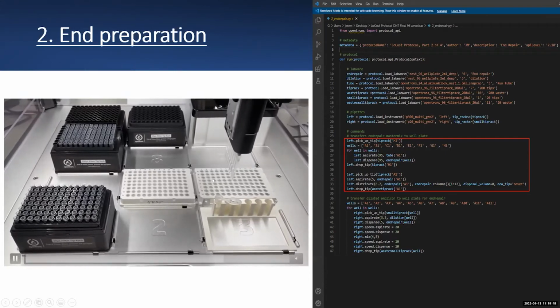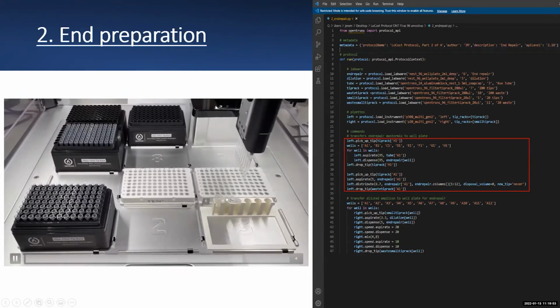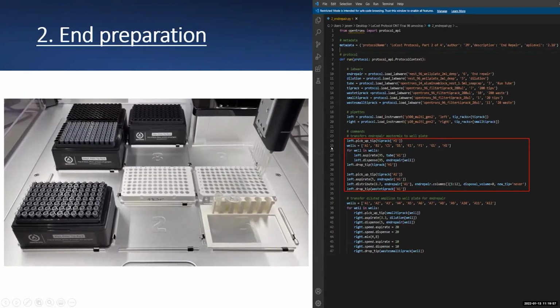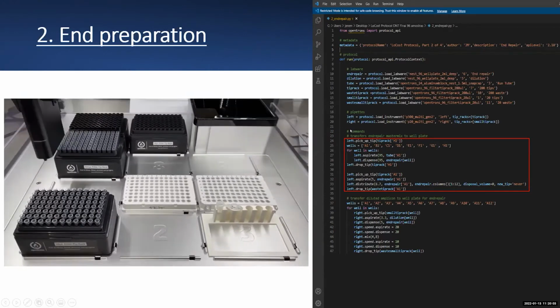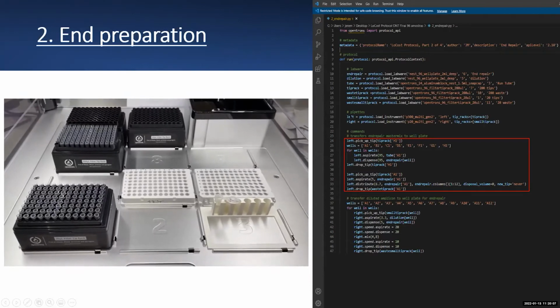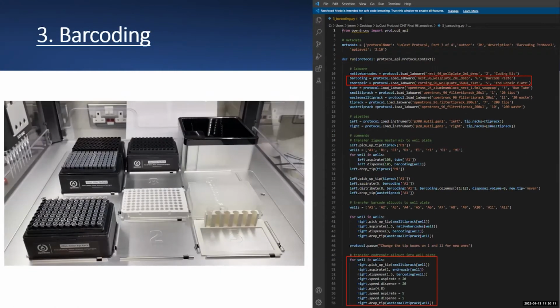So if you are transferring a large volume of samples to a single pipette or vice versa. For example, in this case, when you have a much more valuable master mix, such as the ligase enzymes or the end repair enzymes that we use, it means that your expenditure compared to if you would use a reagent trough is a lot more reduced.